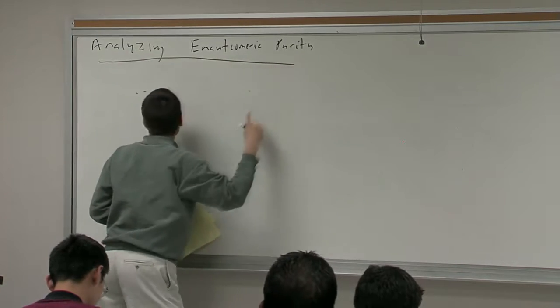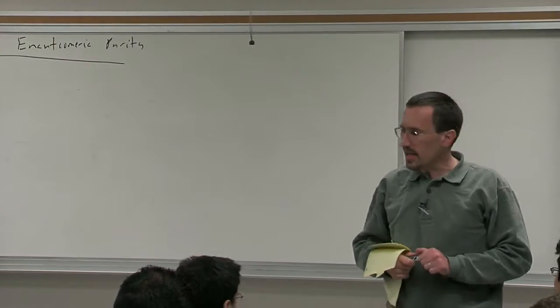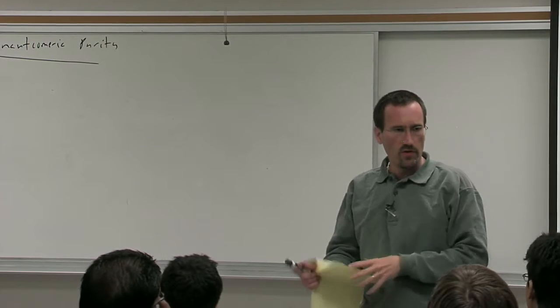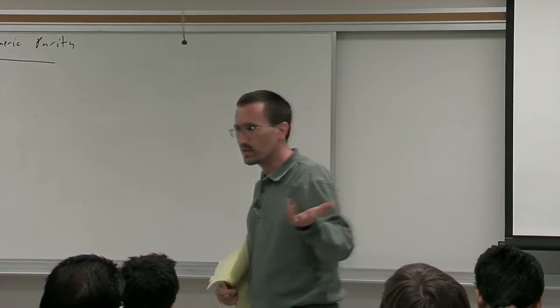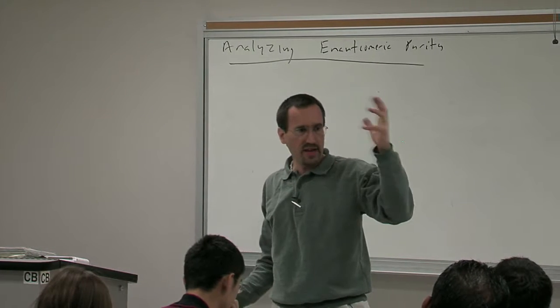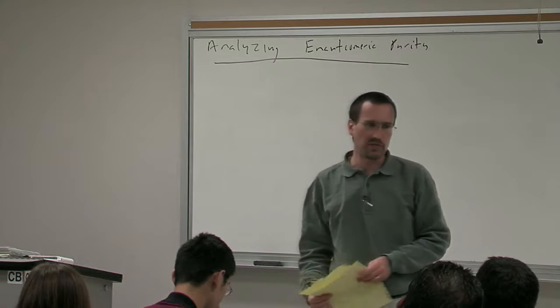And of course, the thing that I've emphasized in the course is that enantiomers have identical spectra. In the absence of some source of chirality, you can't tell an R molecule from an S molecule. And yet, many times, you're doing some synthetic transformation, and you want to ask, what % EE did I generate my molecules in? Or do I have a single enantiomer, or do I have a mixture of enantiomers? And this sort of question then needs some source of chirality.